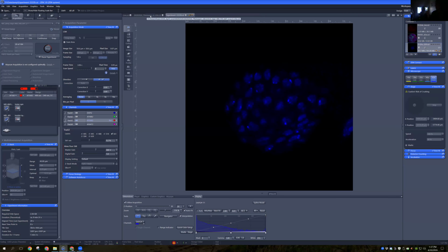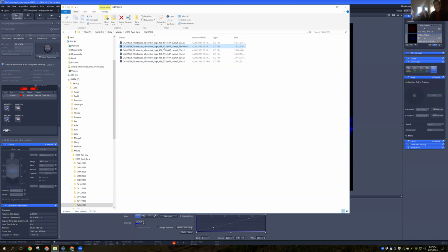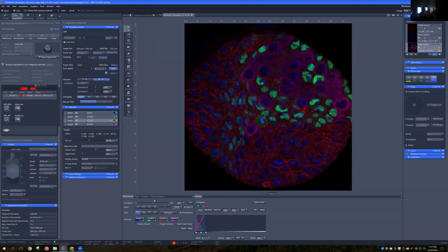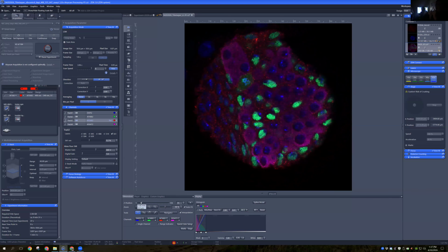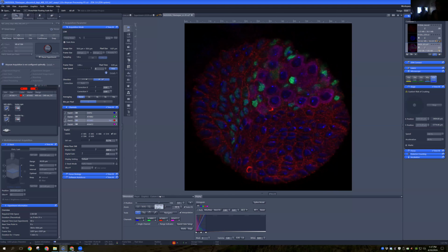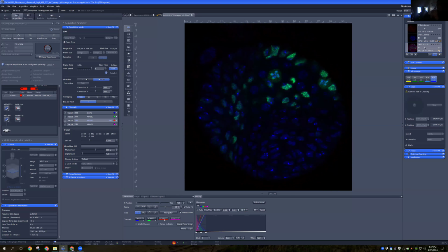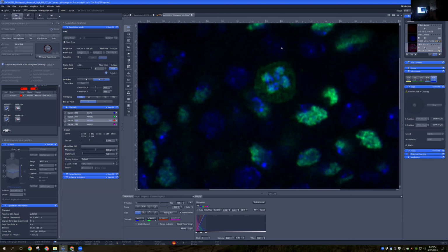You can't manipulate astronomical sources in this way, but you can make the different dyes that you're using actually blink. A dye will light up at one time, and a dye very close to it will light up at a separate time, which allows the images to alternate back and forth so they're not clumped together. This is called super resolution microscopy: by controlling the environment of your sample, you're able to get to higher and higher levels of resolution, because the dyes are emitting light at slightly different times.